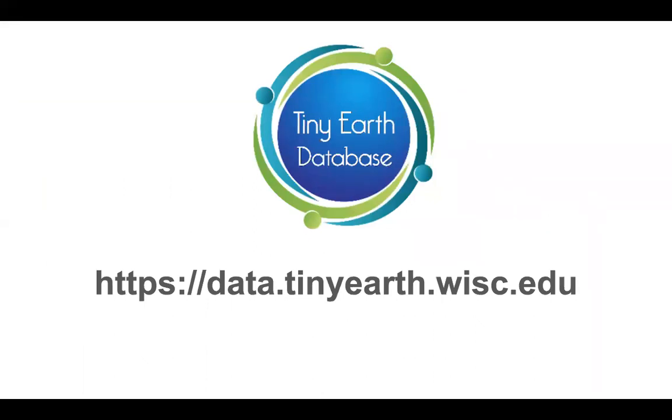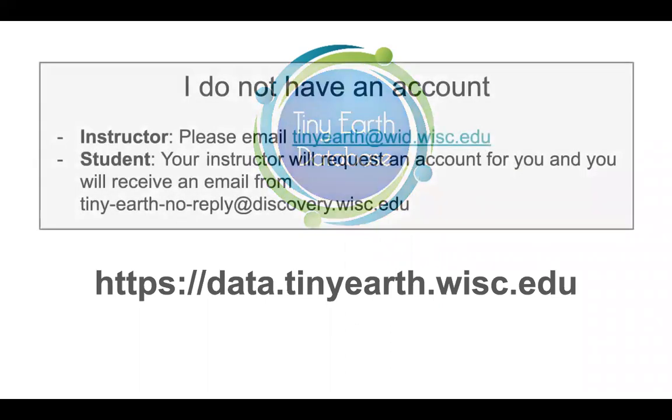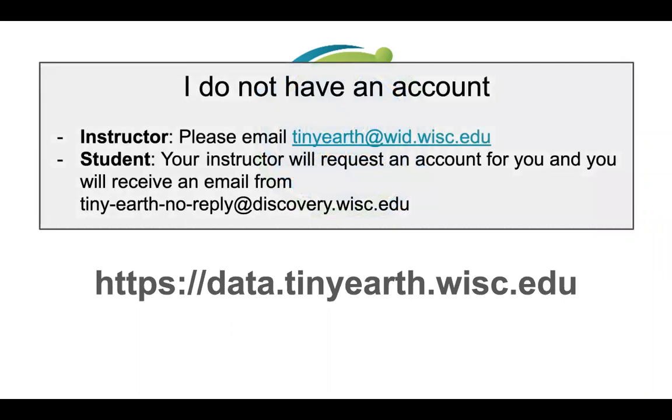In case you want to practice in the database, you can reach it at data.tinyearth.wisc.edu. This is totally optional, because we'll be showing you many screenshots of the interface as we go along. What if you don't have an account? If you're an instructor, please email tinyearth@wid.wisc.edu and we will get you an account. If you're a student, we'll hear today how your instructor requests an account for you, and you'll receive an email from No Reply Tiny Earth after your instructor has gone through the process.